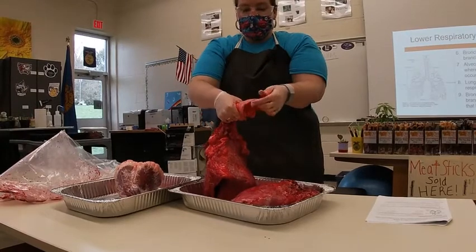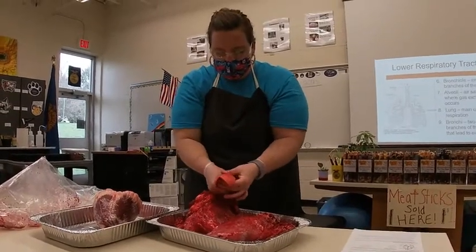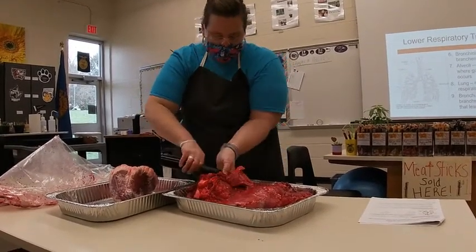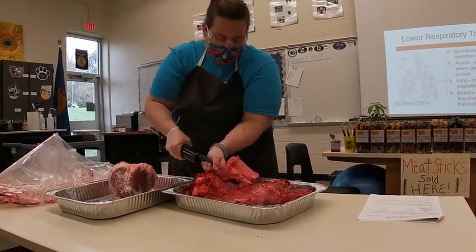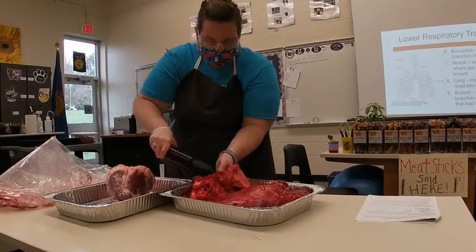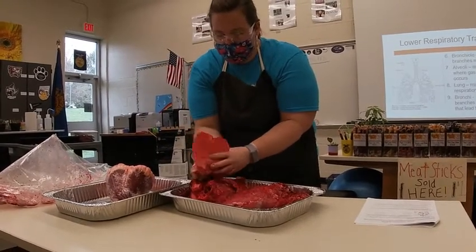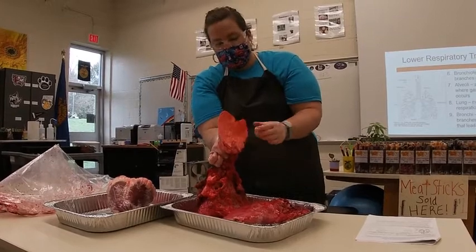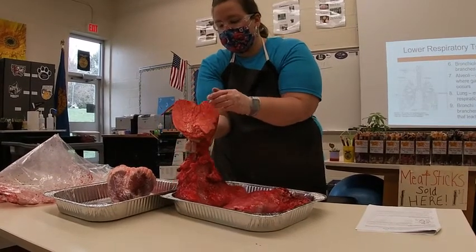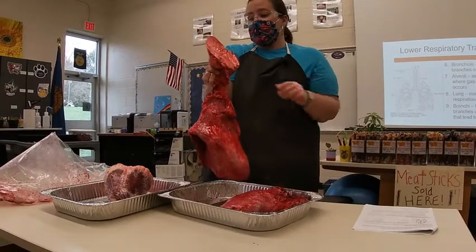It expanded because of the air present. So here is a partially inflated lung. Each of these would be the bronchioles, leading to the sacs — the air sacs, which would be the alveoli. We can see each of the bronchioles and the alveoli are what's expanding. Super cool.